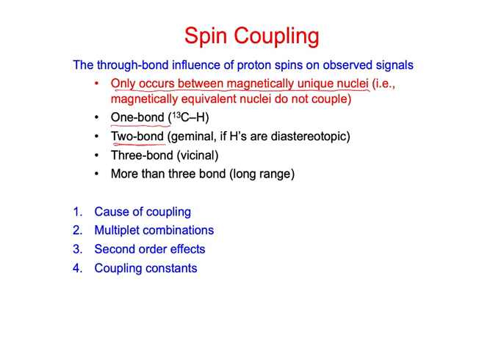Okay? The most common are the three-bond or the vicinal couplings. Those are protons on adjacent carbons, so 1, 2, 3 bonds away. And then we can have more than 3 bonds, which we can kind of lump into long-range couplings. And these can be like allylic, or they can be in benzene rings, or things like that. Okay, so what we're going to do, we're going to first go through kind of the cause of the coupling. We're going to look at different peak combinations.